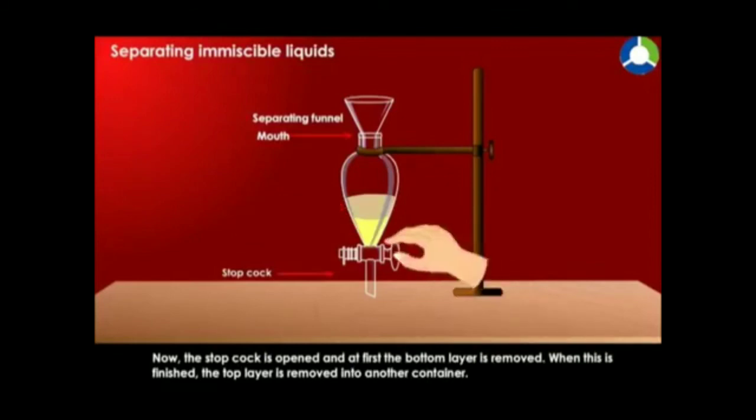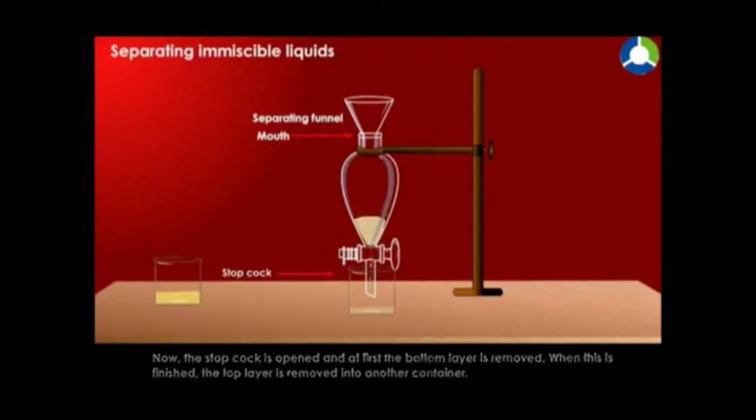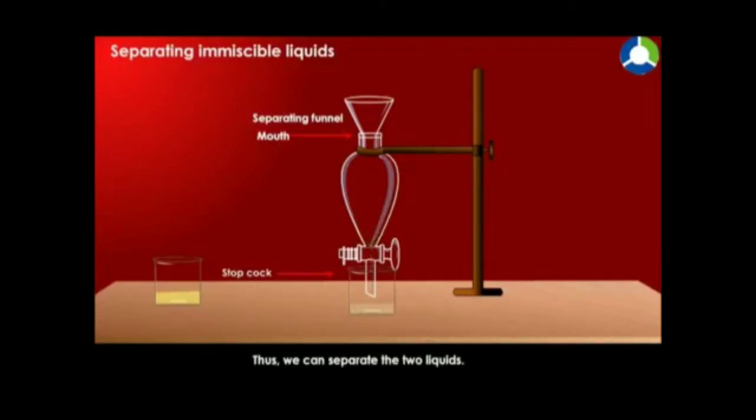Now, the stopcock is opened and at first the bottom layer is removed. When this is finished, the top layer is removed into another container. Thus, we can separate the two liquids.